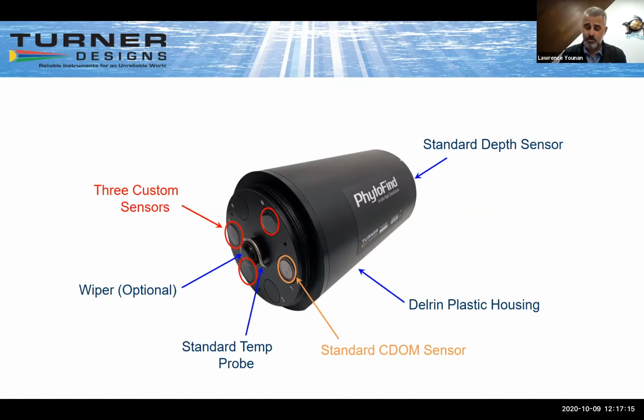I'll talk a little bit more about that because organics are going to be the biggest killer when you go into an environment to try and do any kind of in vivo work, in situ work, especially if it's looking at chlorophyll fluorescence or any pigment fluorescence. Dissolved organics are highly interfering. So there has to be a correction for them, absolutely. And typically when people use in vivo fluorometers like chlorophyll tracking, they don't do any kind of correction for dissolved organics. Now, turbidity isn't such a big deal, but organics are going to really affect your signal.